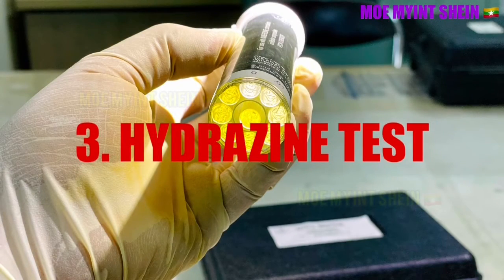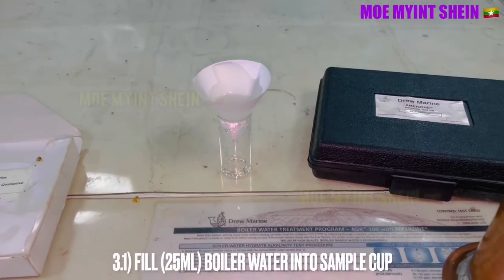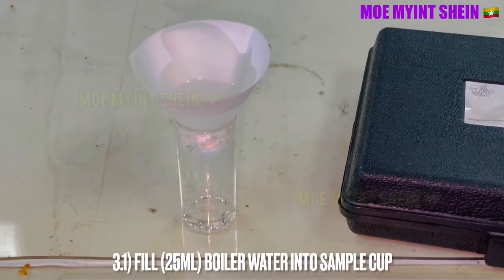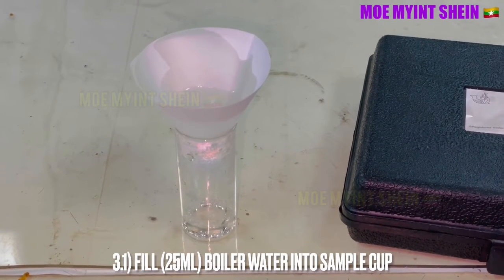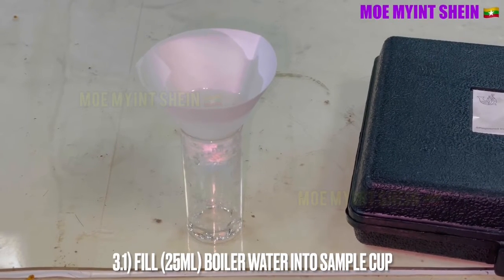As the third test, I will show how to carry out the hydrazine test. Fill 25 ml of sample water into the cup.